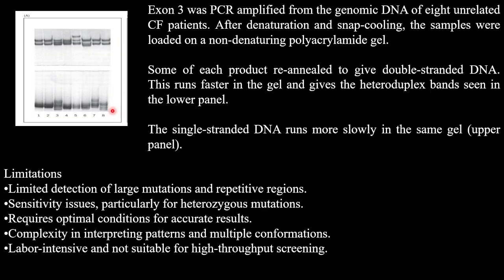And there are some limitations as well. Limited detection of large mutations and repetitive regions. There is a sensitivity issue because this is done by autoradiography, and you can't rely on these kinds of results if you are doing patient samples, because there might be some mis-loading or something.